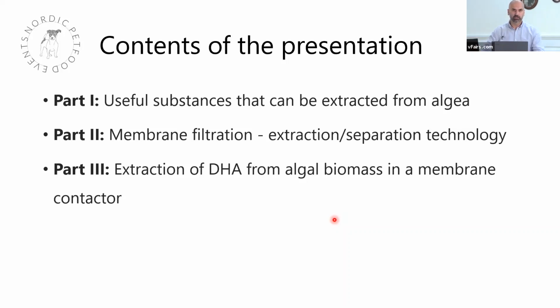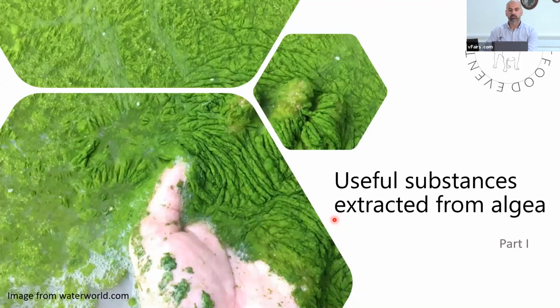In part three, we will present an extraction method for DHA, also extraction of DHA from algal biomass in a membrane contactor. So let's start on part one.